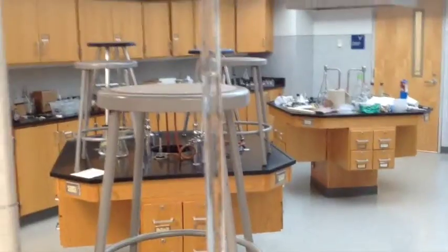Now the first thing you're going to need to do is read the burette. This can be difficult to do. So you hold up a piece of paper, find the meniscus, there it is, and you actually count from the top down. So this is 5, and level with it, there's the half-line. So this is 5.5 milliliters.